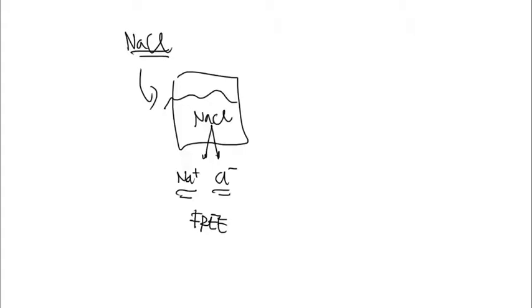Now, if there's any solid sodium chloride that's still there, and it's NaCl, and it's not broken apart, then this is not free, and because of that, it probably will not be measured.